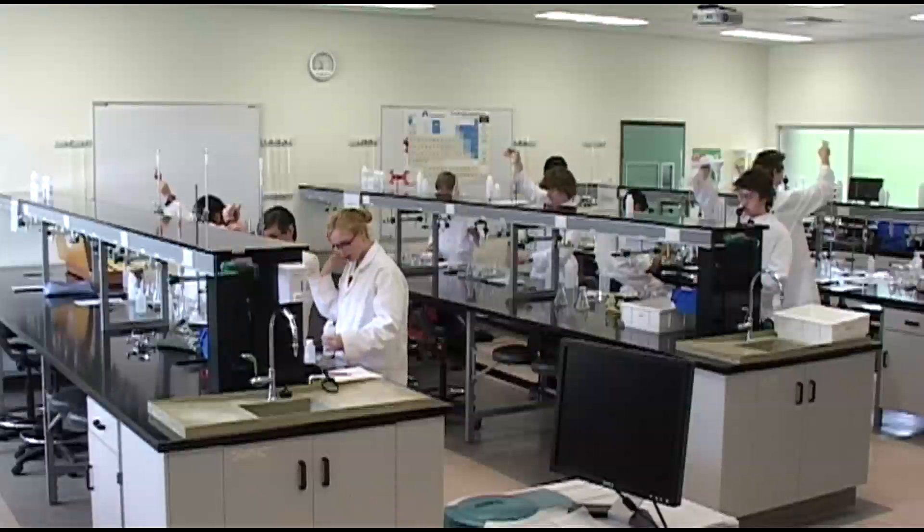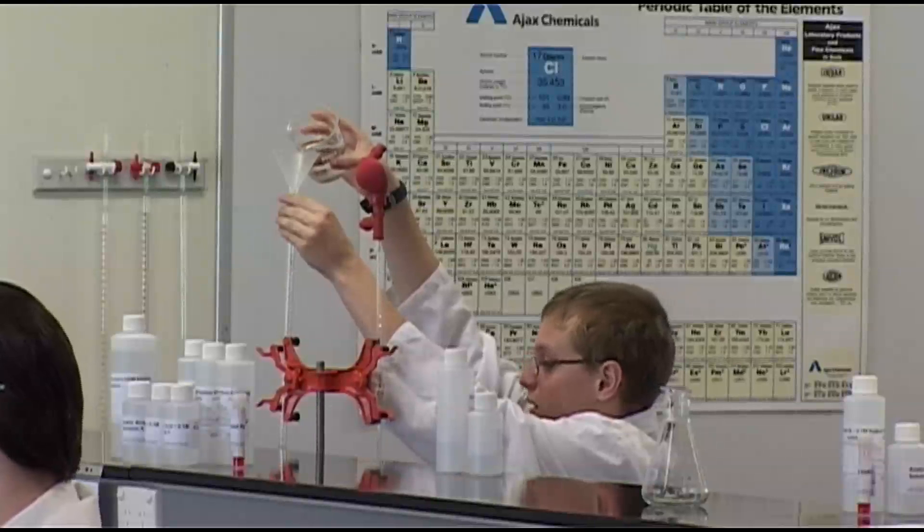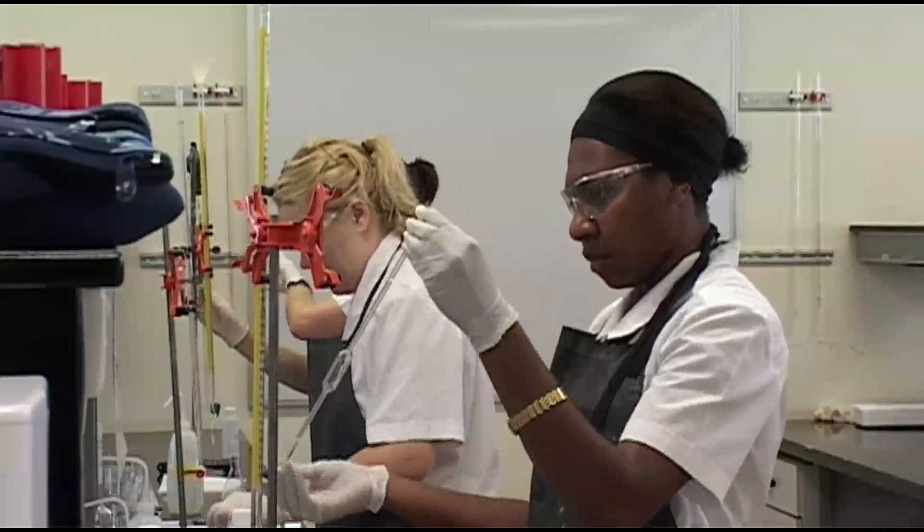What's involved is that we take a known acid against an unknown base, and we find out the concentration. We know the concentration of the acid, we don't know the concentration of the base, so we use volume and then calculate the concentration of the base.